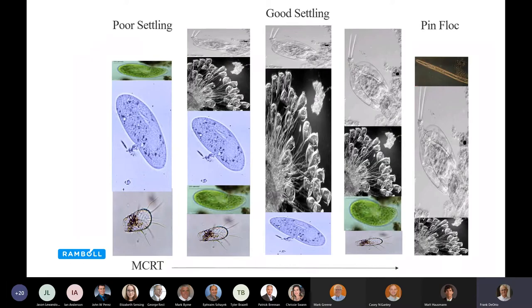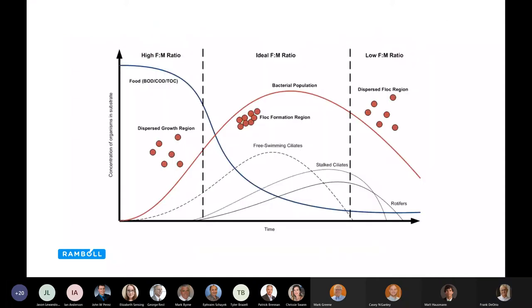Here's an illustration of what we see under the microscope under those same conditions. At a high food-to-mass ratio, bacteria are rapidly growing — they're not forming filaments required to form a flock structure, so they're kind of dispersed growth and settling can be poor. As time goes on, you develop a different population: stalk ciliates, free-swimming ciliates, good flock formation, polysaccharide formation which allows bacteria to adhere to each other, and a good settling flock. At longer sludge ages, that starts breaking down again.